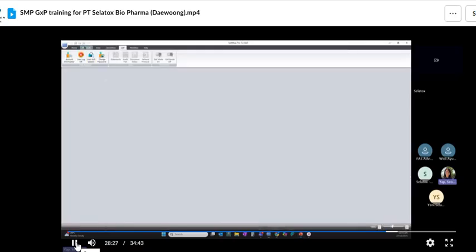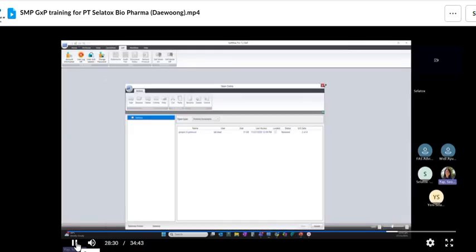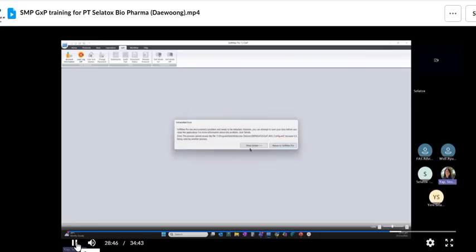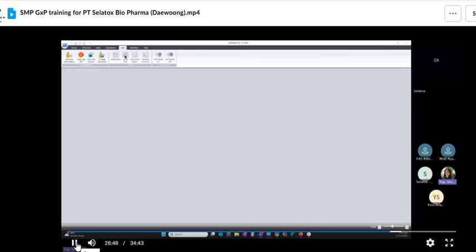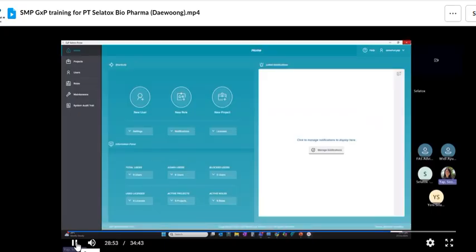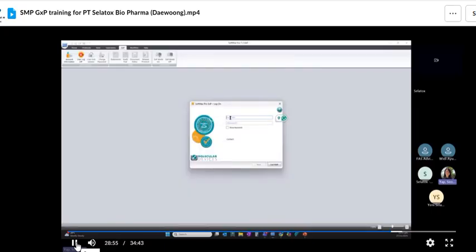Okay, so come to here. Oh, sorry. First, I need to log off and then log in as a lab manager. The name here is lab lead. Lab manager, log in to this project. Oh, something is wrong. Let me log in again. Did I open all the files? Let me just close. Yeah. Let me log in again.